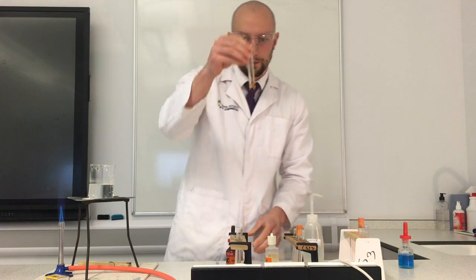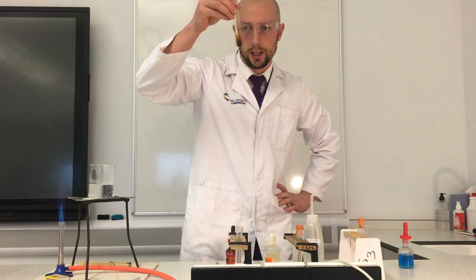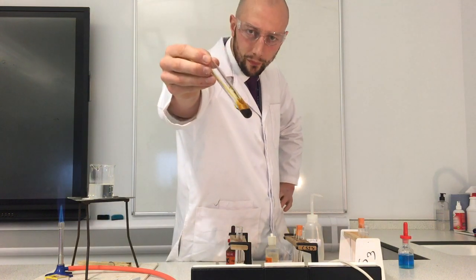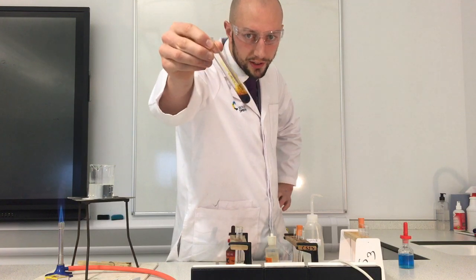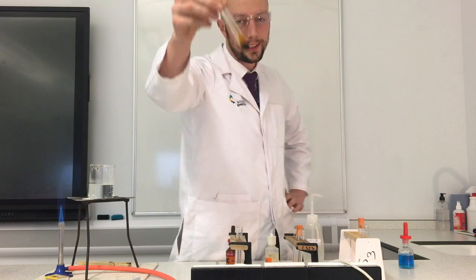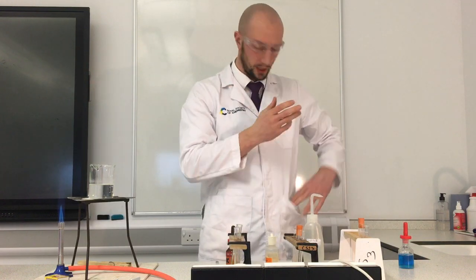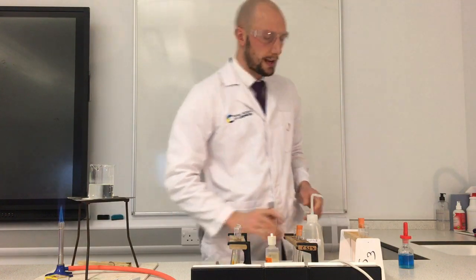Alright, this is a good one. Let's see if it changes to dark blue. I'm giving it a good shake. Have a look, that's brown. It's still brown. Definitely not going dark blue like our rice cakes did. It's not got any starch in it. Oh, I've got a bit of a muck there.